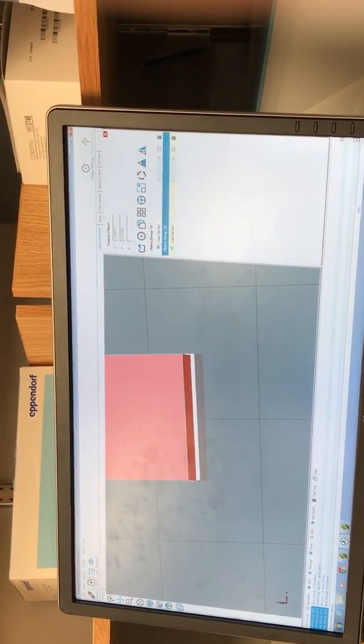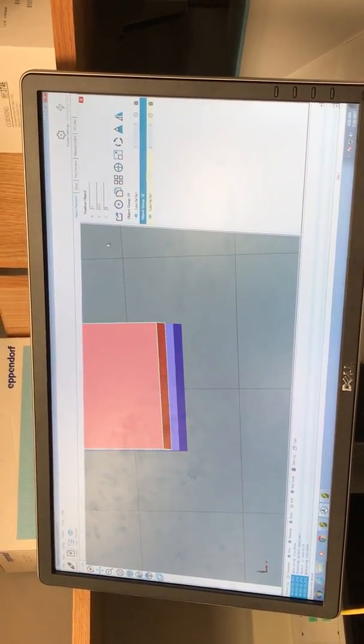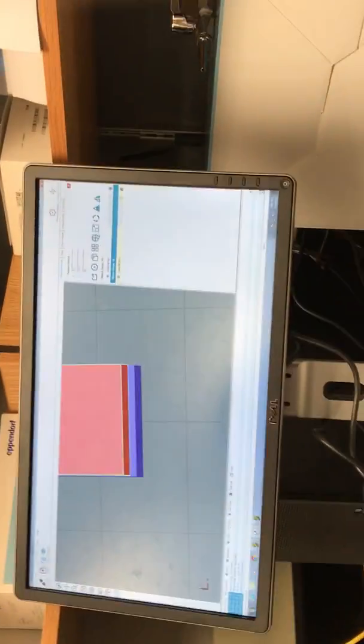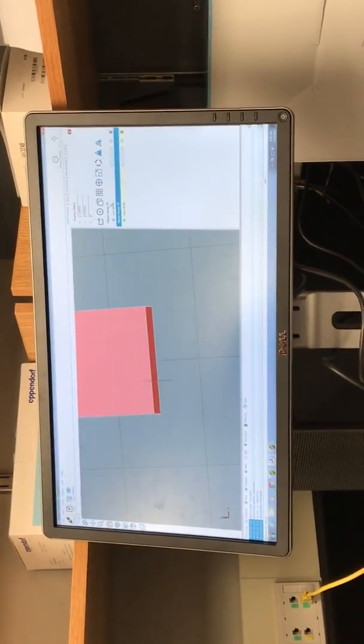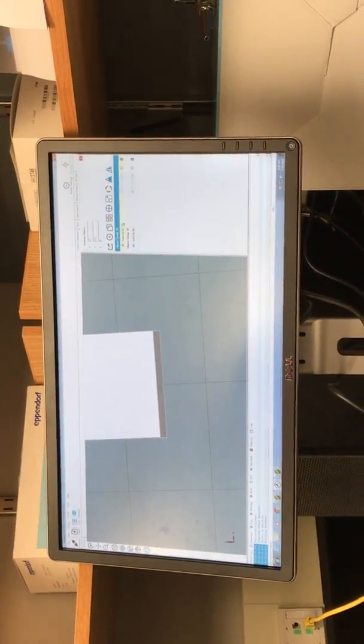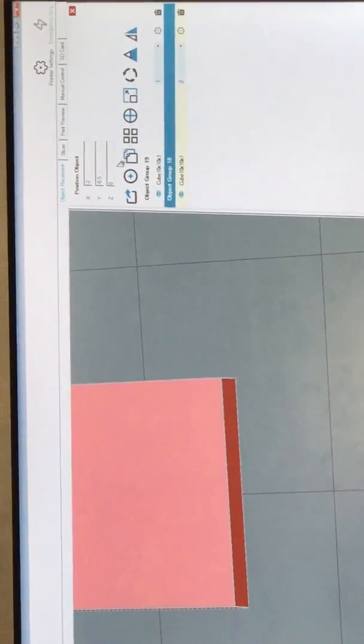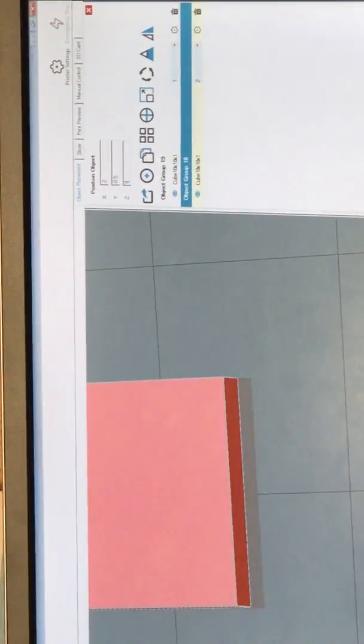You can print them on top of each other? Exactly, I just want to put them on top of each other. Center both of them, and then just offset one of them.